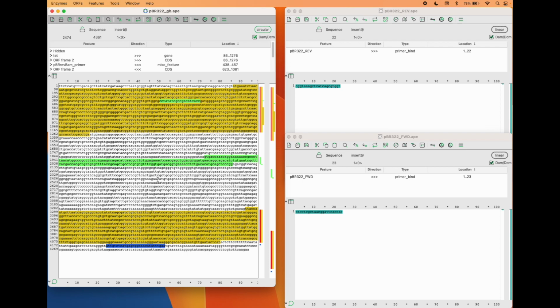And one more thing to note here is within the sequence, you'll see some different colors. So you'll see the yellow, the green, the blue, and these are just annotations that scientists have added to the sequences to know what that region of DNA does. So you'll see it here, you'll see it in the plasmid, and that's all that really means.